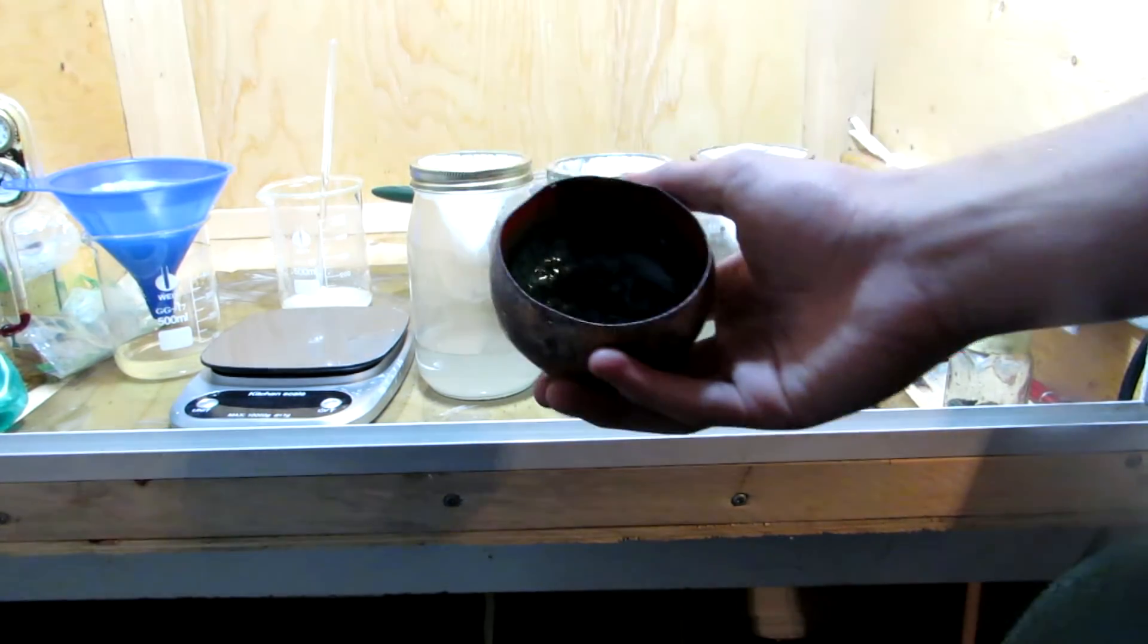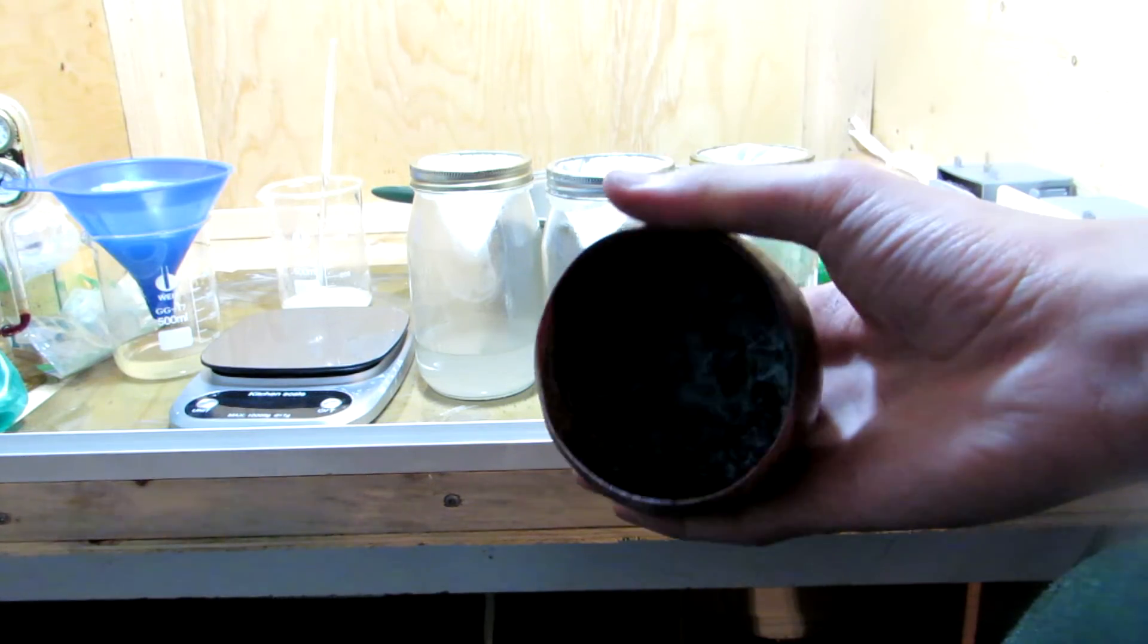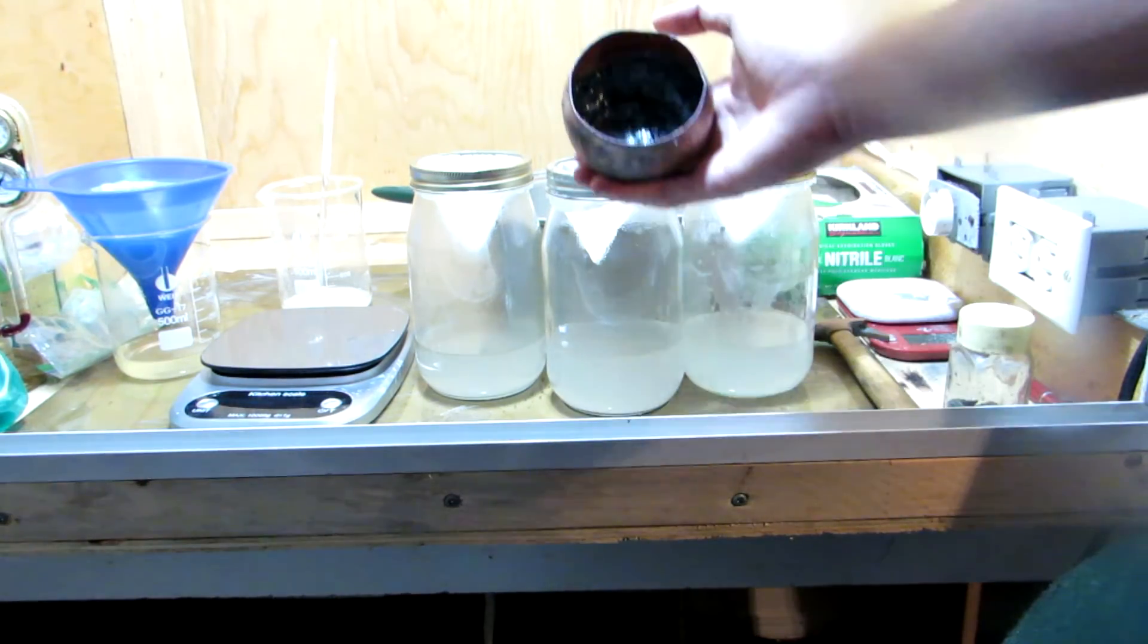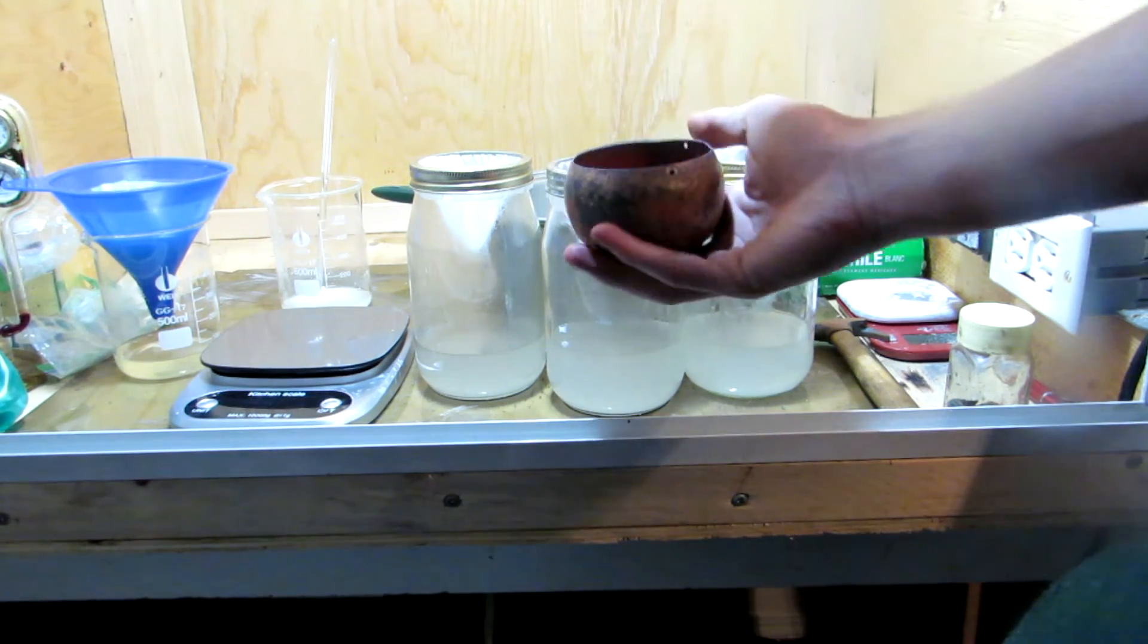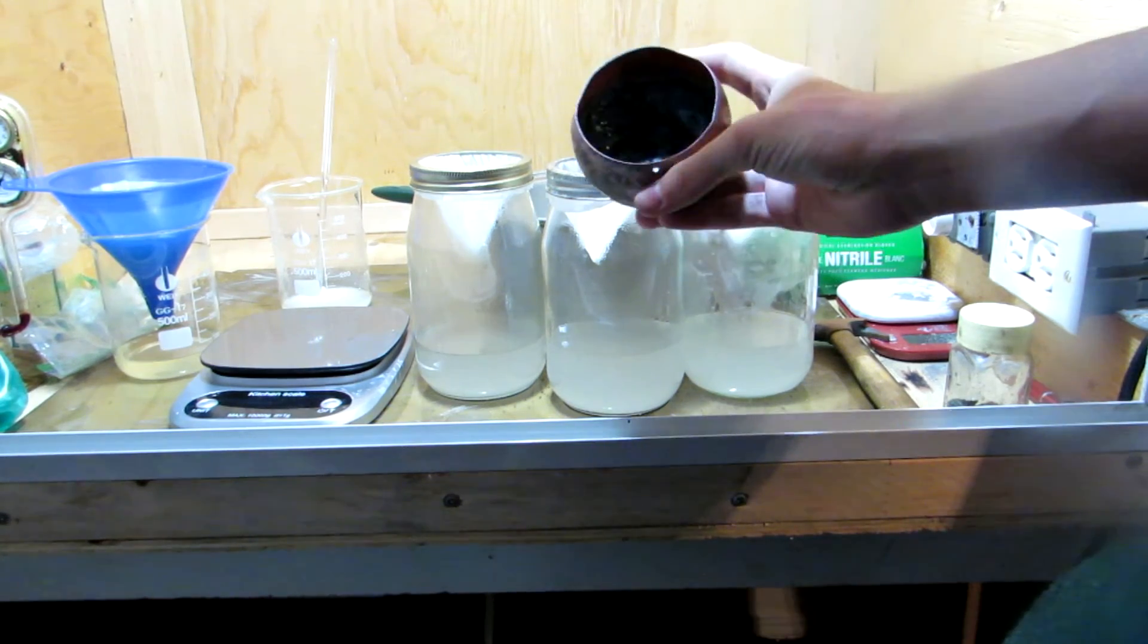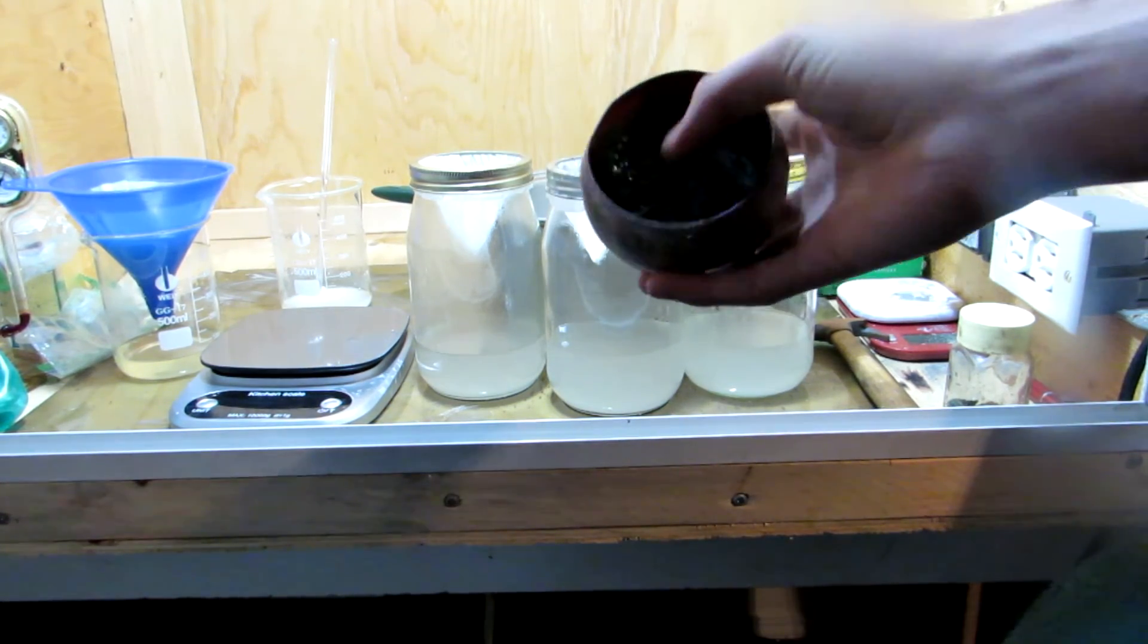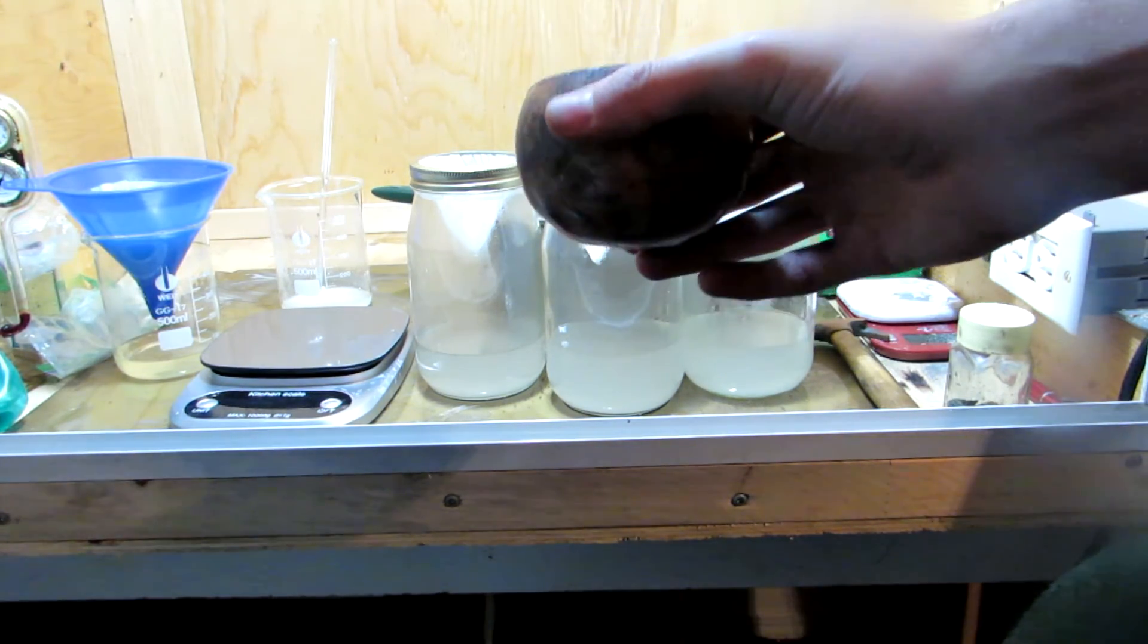Now, unfortunately, I was not able to find the footage of me using the blowtorch to heat this up. I'm not sure where that went, but you can see that after heating it up fully to decomposition, it's glassy and green. If you were to do this in a rigid steel vessel or something, it could be fairly challenging to break out, so doing it in this thin copper dish just makes it easy to smash apart and break into smaller chunks.